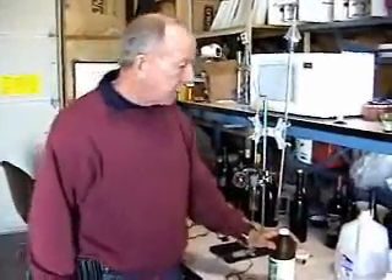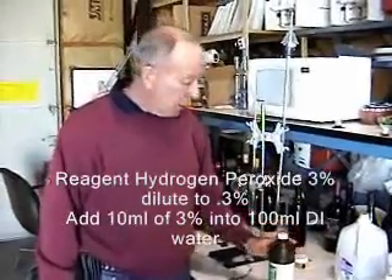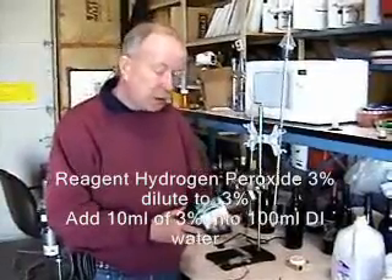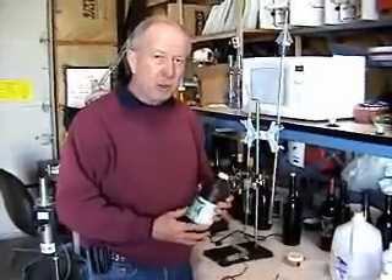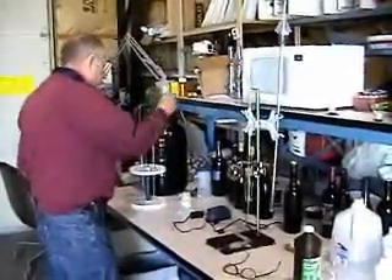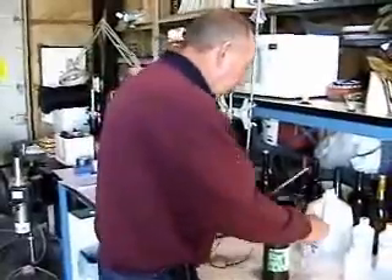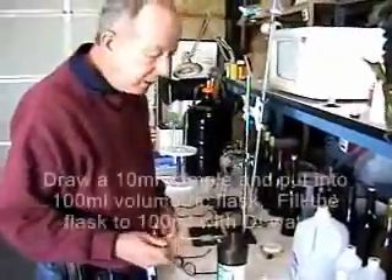We're going to start with the hydrogen peroxide. We recommend on the instruction sheet that you get some from the local pharmacy or grocery store, which is a 3% hydrogen peroxide solution. It needs to be diluted down from 3% to 0.3%. The way you do that is you take your 10-milliliter pipette and your 100-milliliter volumetric flask.